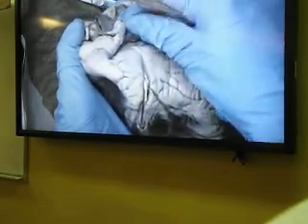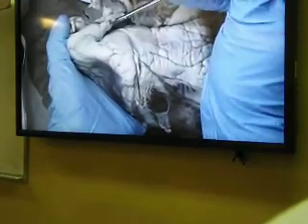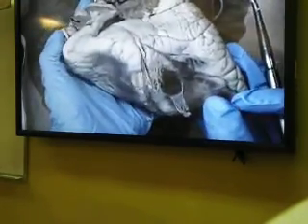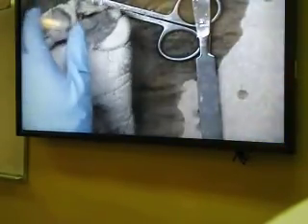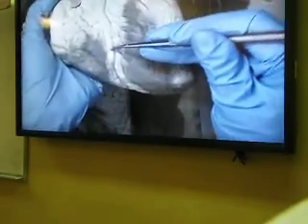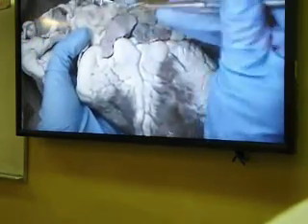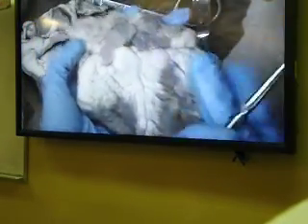That, plus the base having this pipe-like structure, which we already know are blood vessels, tells us that I'm looking at the anterior or ventral surface. This heart may look a little bit better with that. So here is my anterior interventricular sulcus, apex, base, and the base has those blood vessels coming out. Alright.